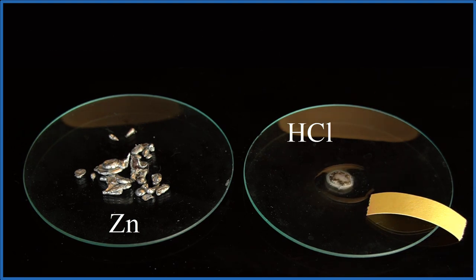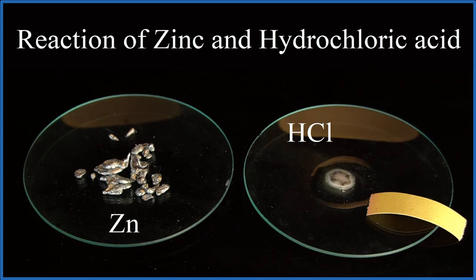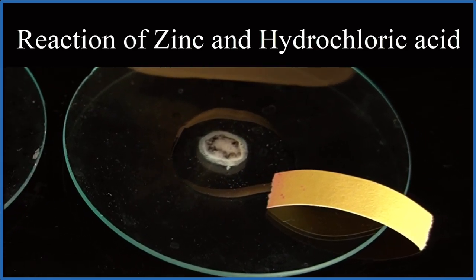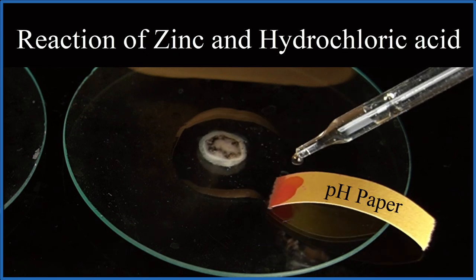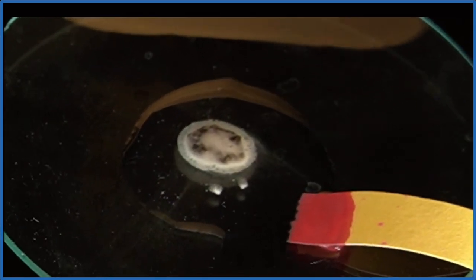So I have zinc metal, I got this from pennies here in the US, and we put hydrochloric acid, concentrated hydrochloric acid on it, and you see right away we get those bubbles. That's hydrogen gas.